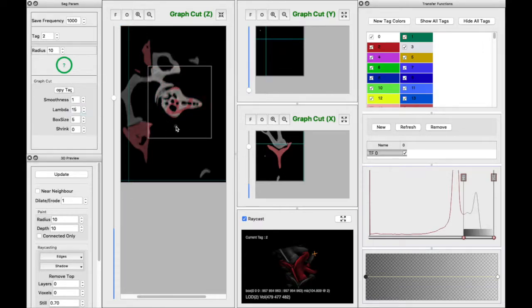Let's increase lambda quite a bit. See, it's not sure what it wants to do in that area, so it'll kind of stop and ask us. Ah, shoot, and erase some stuff over here. So let's increase lambda, and actually I need to color in what was taken over there. So I'll make the box a little narrow on that side. Press T. And see, is this part of our vertebrae? Yeah, it is. So we can see what we can do. No, I'm going to do 255. Yeah. Does an all right job.